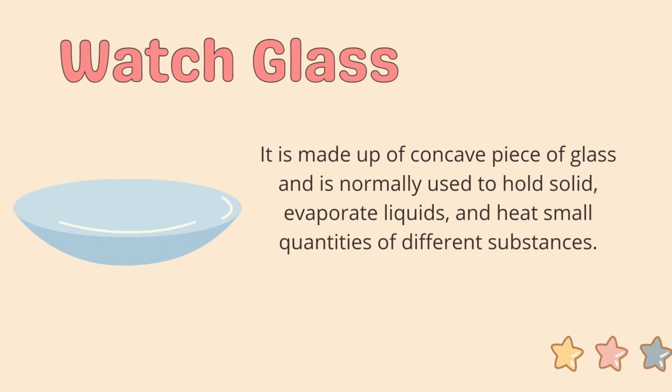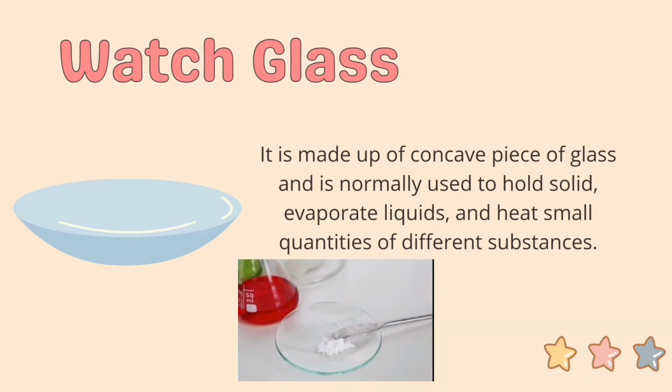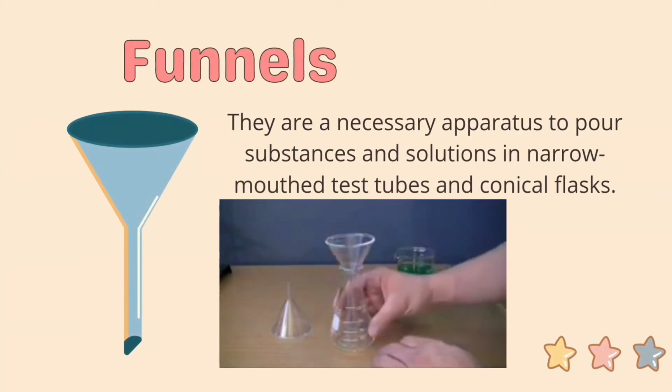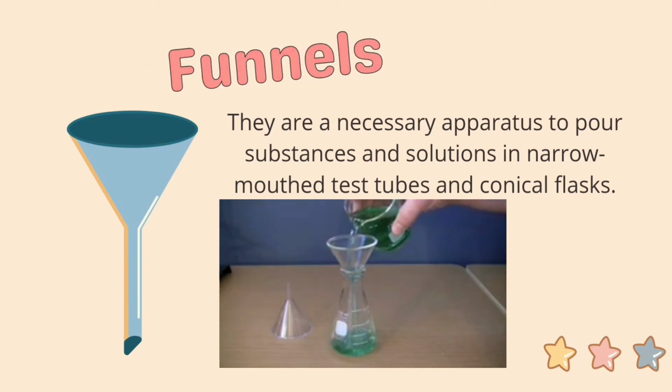Watch glass. It is made up of a concave piece of glass and is normally used to hold solids, evaporate liquids, and heat small quantities of different substances. Next are the funnels. Funnels are necessary equipment to pour substances and solutions in narrow-mouthed test tubes and conical flasks.